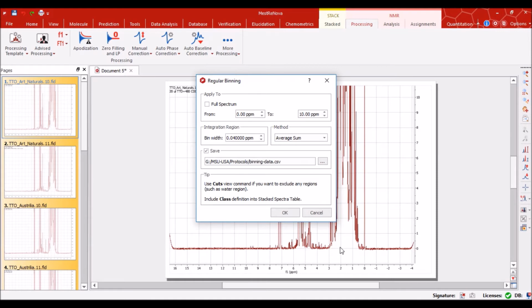If we don't want to cut at this stage, we can cut those spectral intensities in the Excel sheet. When we transfer or export this data to an Excel sheet as quantitative data, then we can delete those bins which are not required. But we can cut it here as well. So how to do it? Okay, we can do it, or we can cancel it and cut it before that. So okay, I will cancel it.